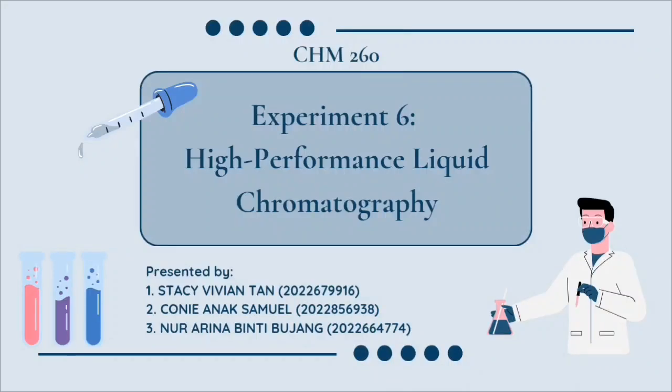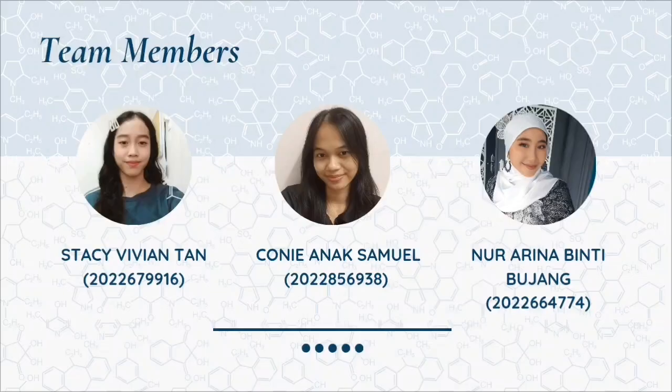Hi, in this video, our group will be presenting Experiment 6, High Performance Liquid Chromatography. So these are our group members.